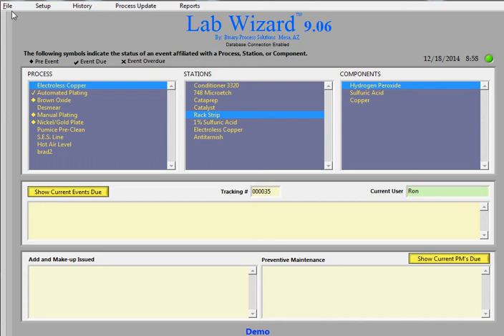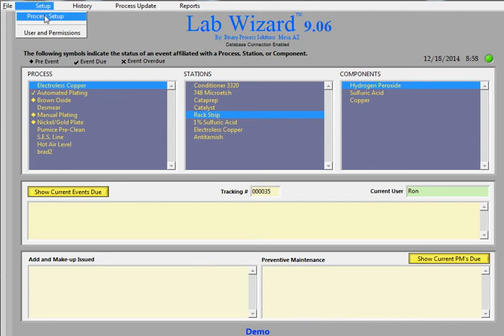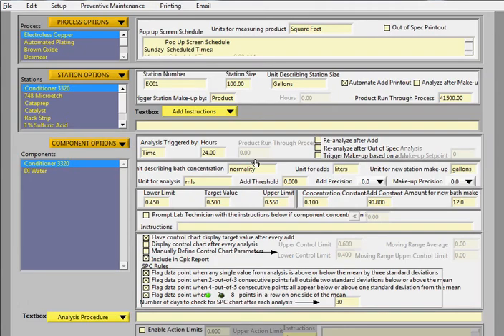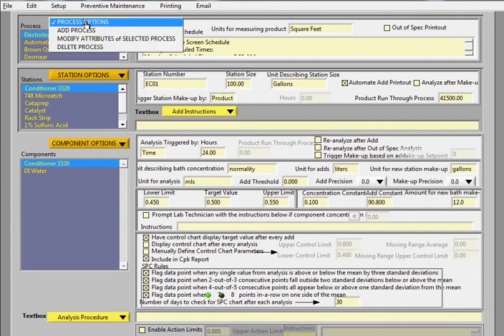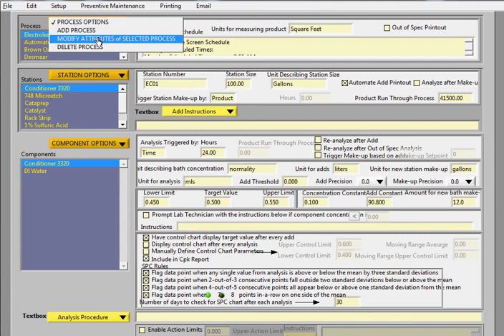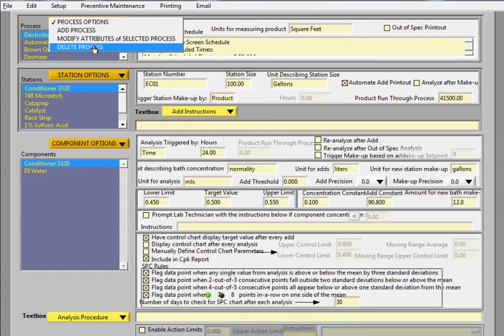Let's go into the setup area of the program. We'll click on the setup menu and process setup. So here we see the process setup screen. There's a few options that we have when doing this. We have add a process, modify an existing process, or delete a process.